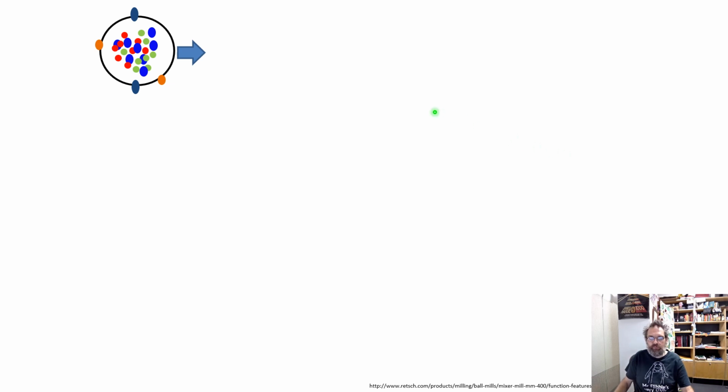So breaking these things open is only one of the problems. Yes, you can add chaotropes, you can add surfactants. They won't do much by themselves, so you need to be able to disrupt things a lot better. The other thing that you want to do is massively increase the surface area of the sample to be able to extract the proteins out as efficiently as possible.